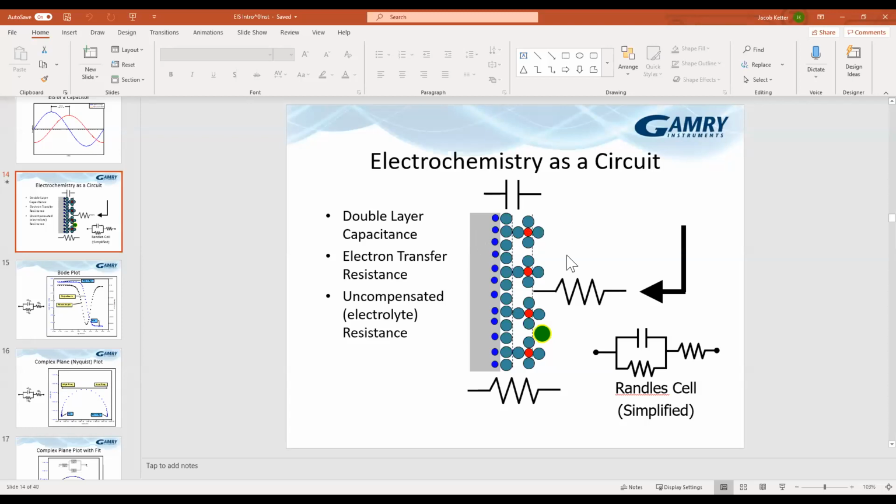50 nanometers on top of a double layer capacitance that's based on the angstrom is like a mountain range. And so that capacitance is going to be very different across that type of a surface, and it doesn't end up being 90 degrees. And if you really want to see a 90-degree type double layer capacitance, go find somebody that's got an old mercury dropping electrode, because mercury is about as close as you can get to atomically smooth at that surface, and that's about as flat as you're going to get. That's as close as you're going to get to a perfect double layer capacitance.